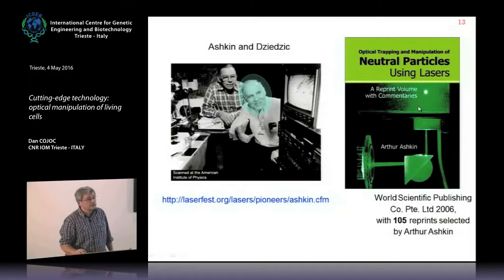What you see here is levitation, particle levitation. So it's a laser through a low numerical aperture objective. You see that you do not have a high convergence of the laser. It's focused into a capillary. And this is a bead of about 50, 70 micrometers. So with the eye, or with a photographic camera, we do not see it. What we see is the scattered light. The laser comes here, and the light scattered by the particle, we see it. And the laser compensates the weight of the particle, so it's levitated.